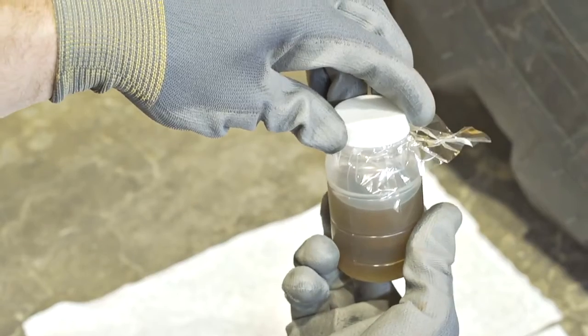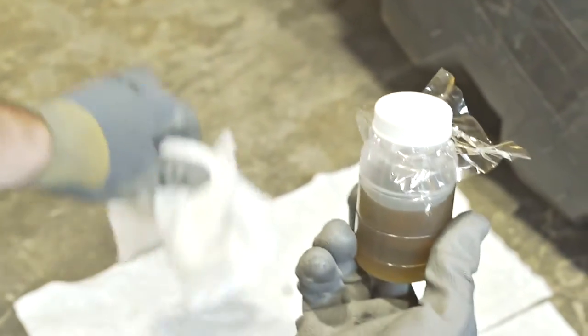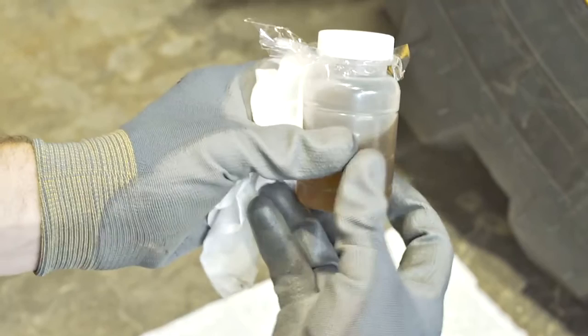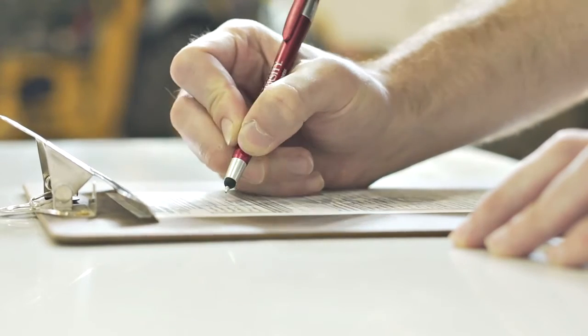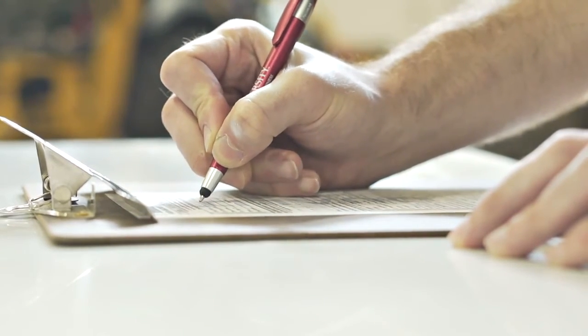Remove the bottle from the vacuum pump and secure the cap on the bottle. Fill out the sample information form completely and submit the form and sample to the designated regional lab for testing.